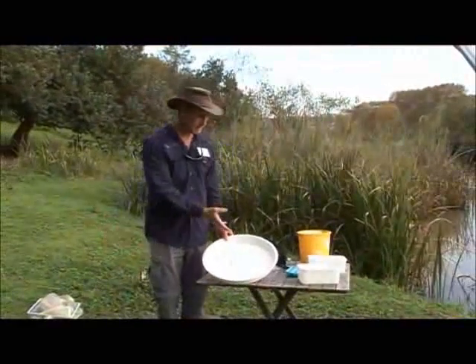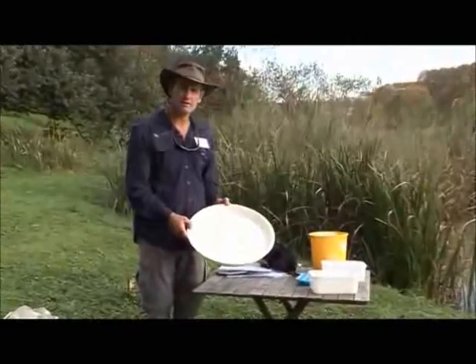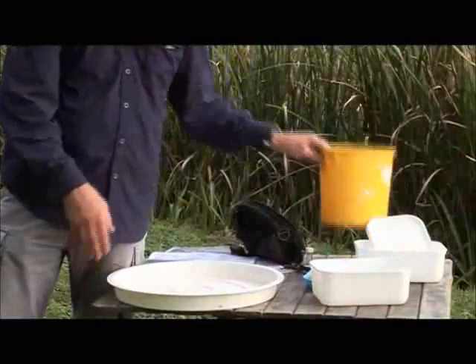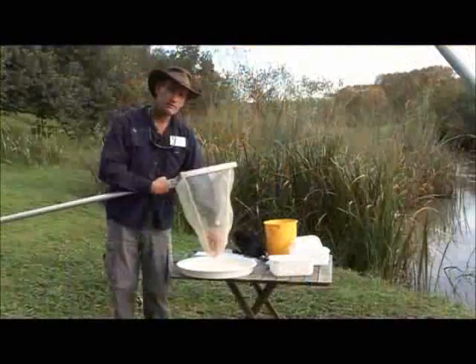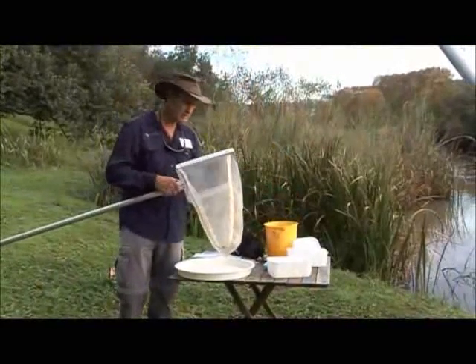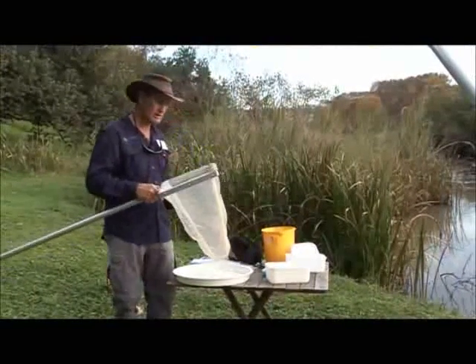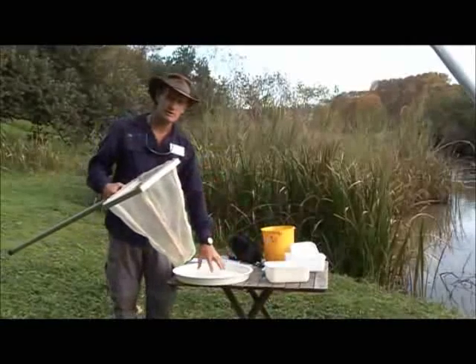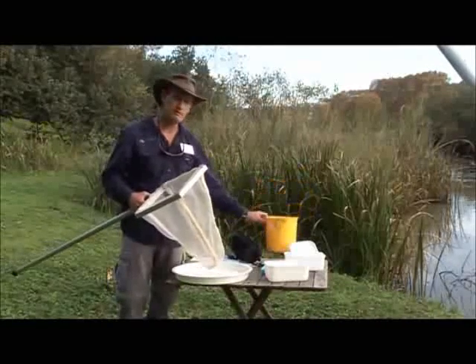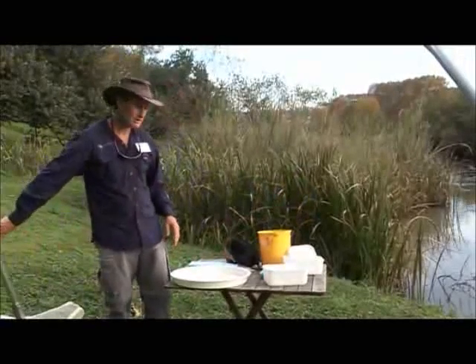We've collected our sample, we bring it back, and we want to put it into something. In this instance, a tray is required. Put the sample onto it, flush the net through with some water, flicking it out. You also need a bucket of water to wash through, as clear as possible. If it's a really turbid river, you may have to bring water in with you, so you don't struggle to identify in turbid water. But if it's a clear river, it's perfectly fine to use the river water. The sample's now on your tray and you're ready to start identifying.